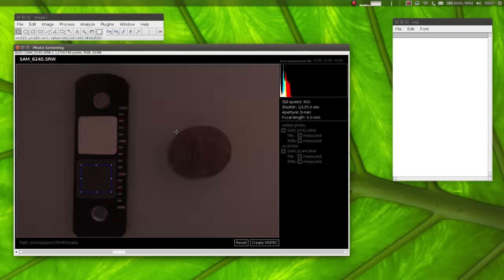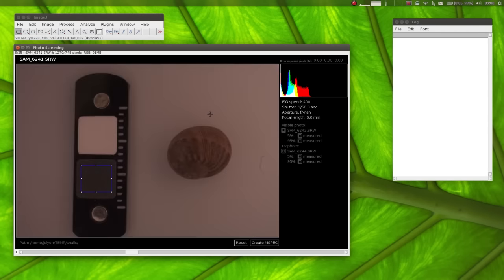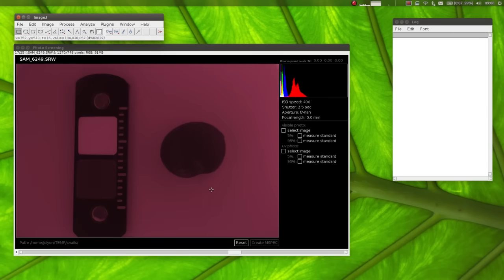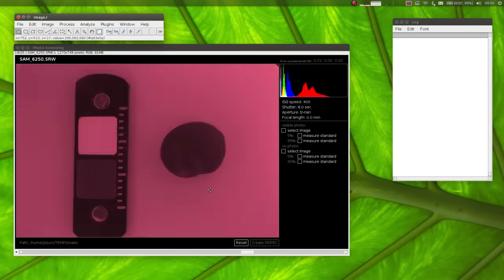Another thing just to point out with the histogram is that it shows you here the percentage of pixels that are overexposed. So here there's a very high percentage and it's warning you that this image looks badly overexposed. There is a separate slice for every image in the directory, so you can scroll through again with your mouse wheel or arrow keys moving between images.